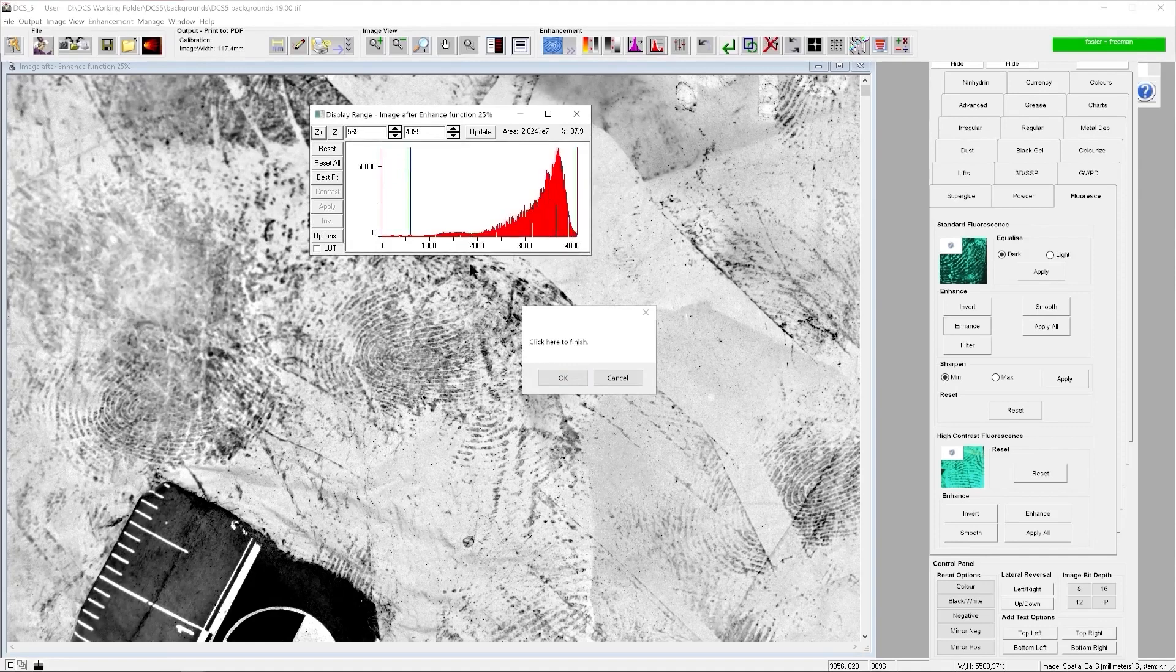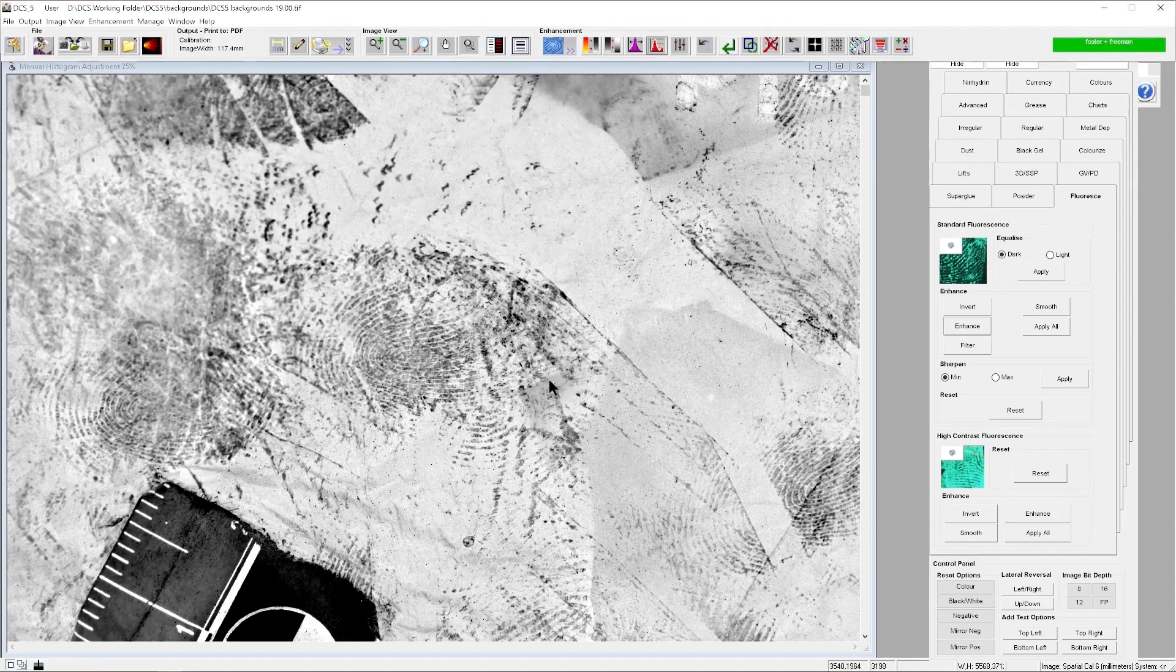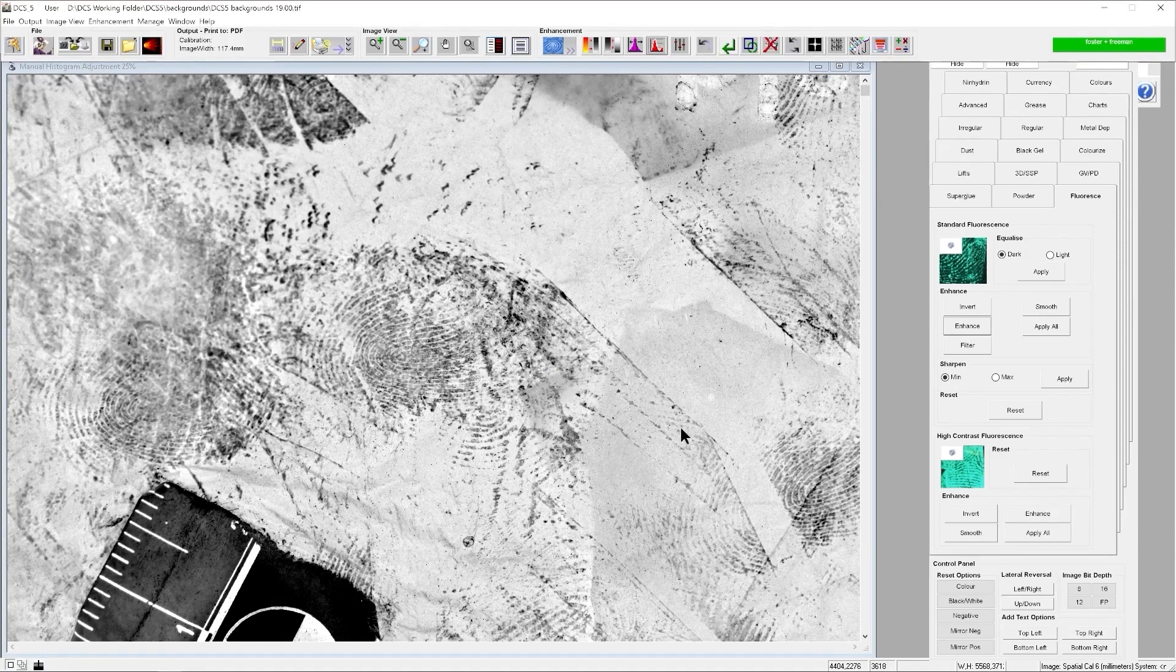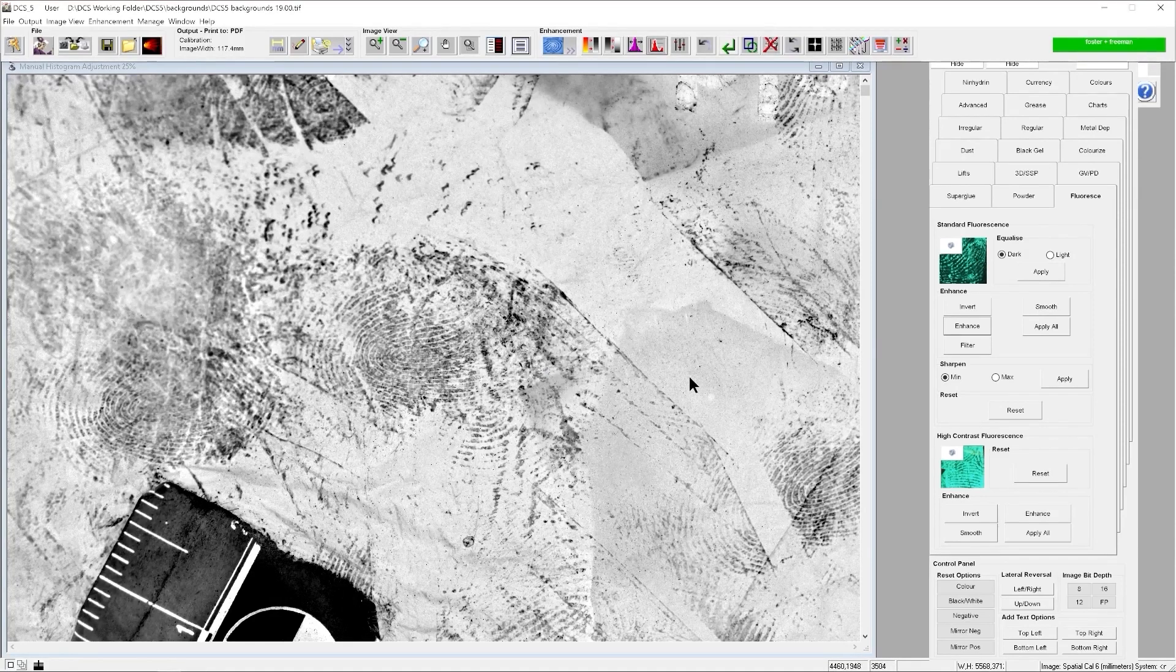Adjust our histogram. And we have our weak fluorescent image.